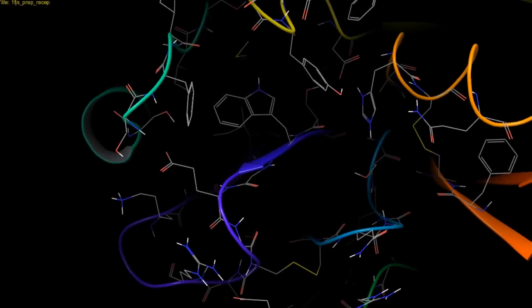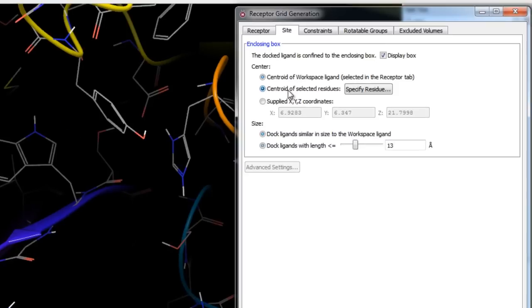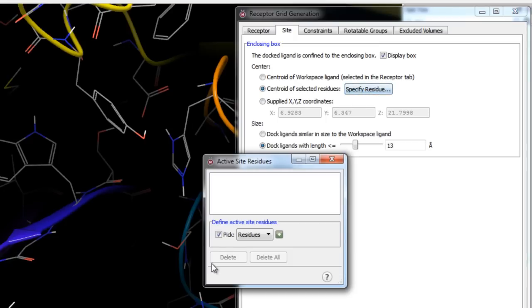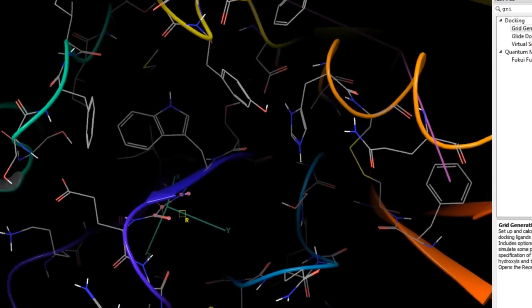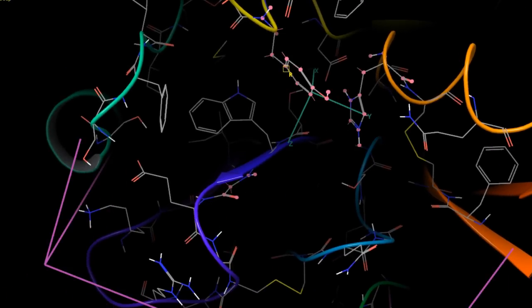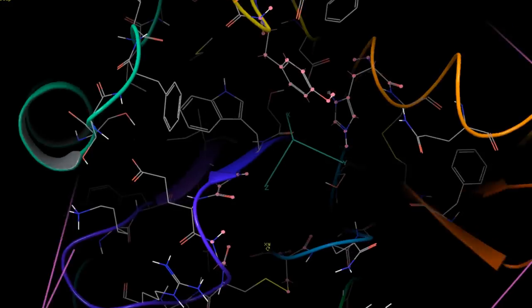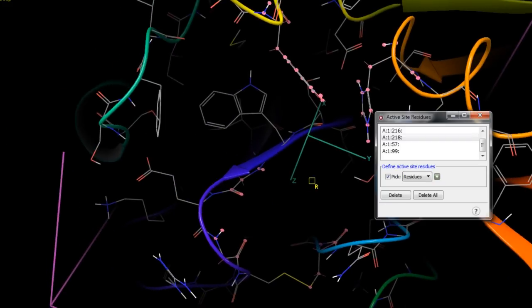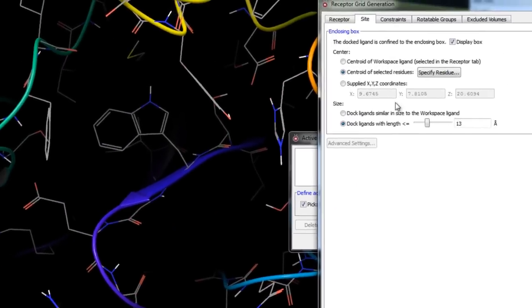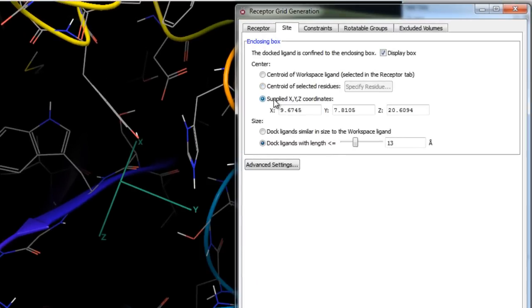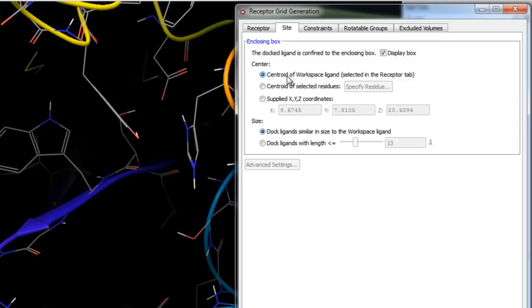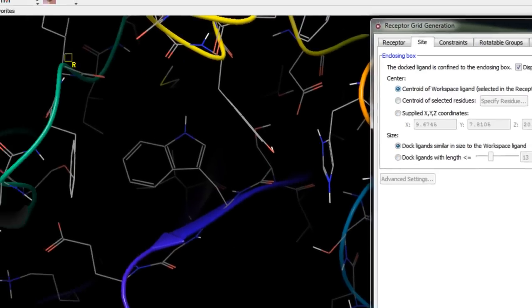If no ligands or sites are present and you only have a receptor, use the Centroid of Selected Residues option to define the enclosing grid box. Click Specify Residues and use the picking controls to pick residues that best define the active site. The third option is to define the enclosing grid box based on Cartesian coordinates. In this example, we'll define the site based on the centroid of the workspace ligand.